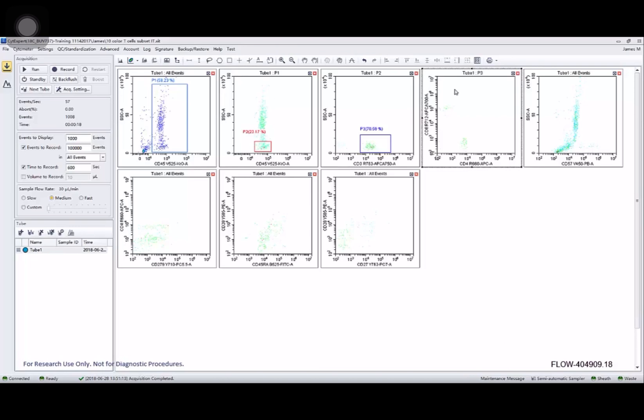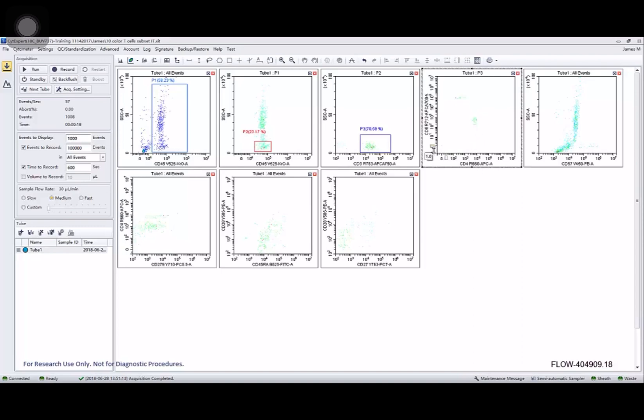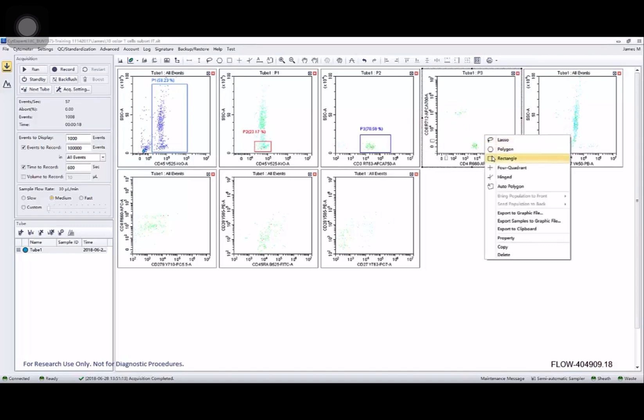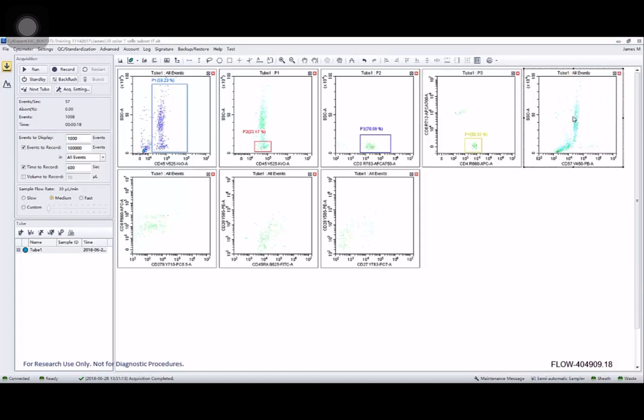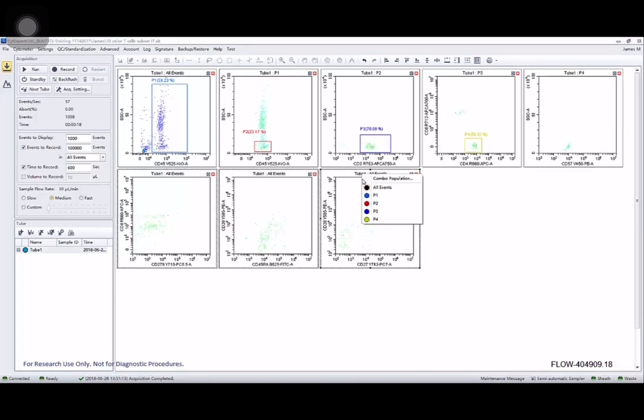Once again I can play with those linear log conversion sliders to get populations appearing where I want them. And now I can clearly see my CD4 population and my CD8s. So let's take those CD4s, apply them here, and let's go ahead and apply them to all three of these. By shift clicking you can select multiple plots and apply that gate to multiple plots.